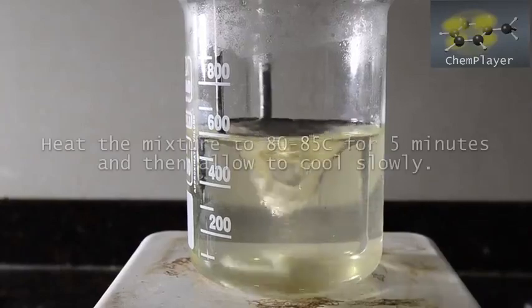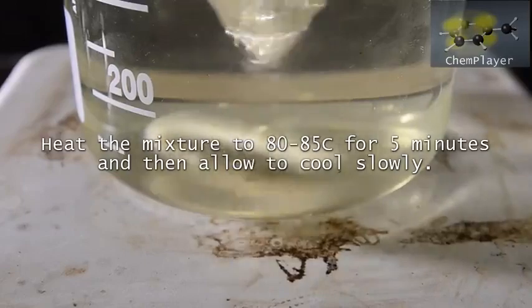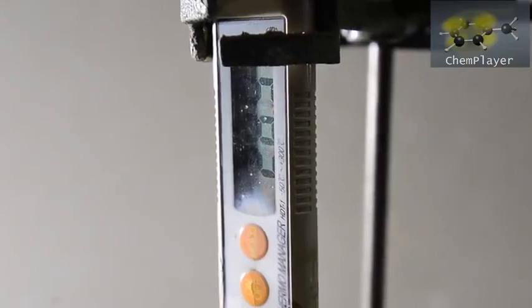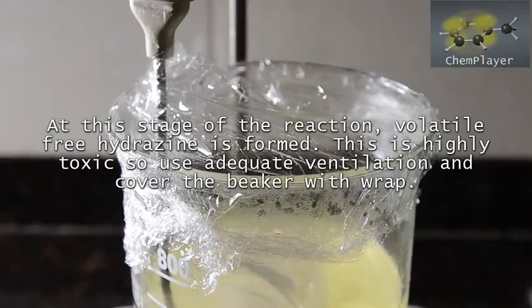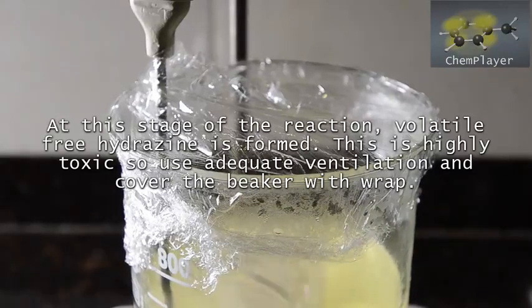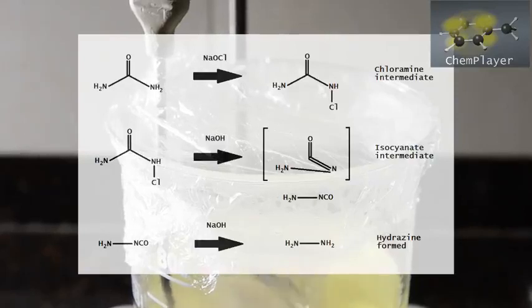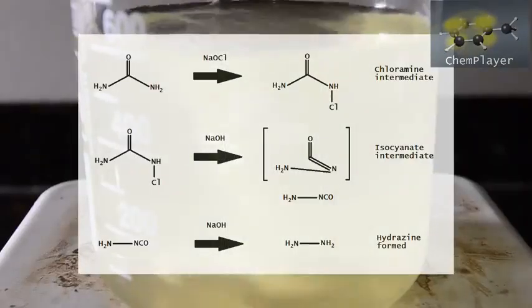So we switch on the hot plate and heat the mixture quite strongly. The decomposition occurs above about 70 degrees C, but you get best results if you heat to above 85. It's a smart idea to cover the top of the beaker with plastic wrap. Hydrazine is quite volatile and you don't want it escaping as it is formed, as you will get a lower yield. In addition it is highly toxic and known to be carcinogenic, so you really don't want to be breathing this in. Here's a simplified reaction schema — very similar to the Hoffman rearrangement.